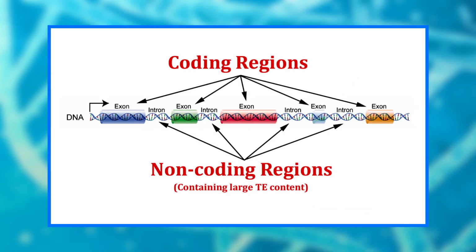The usage of alternate buffer components or polymerase enzymes can help with amplification of long or otherwise problematic regions of DNA. Both the running parameters, for example temperature and duration of cycles, and the addition of reagents such as formamide may increase the specificity and yield of PCR.